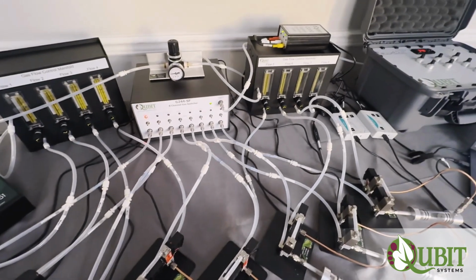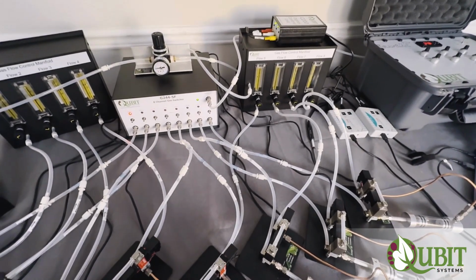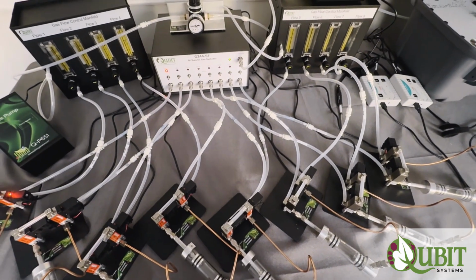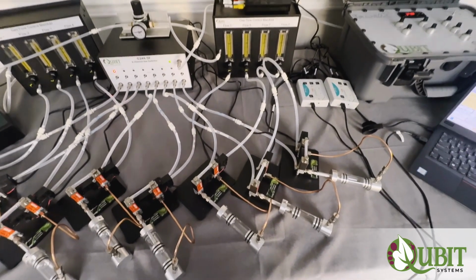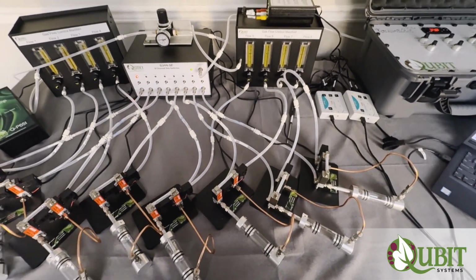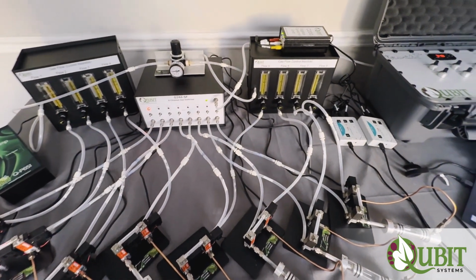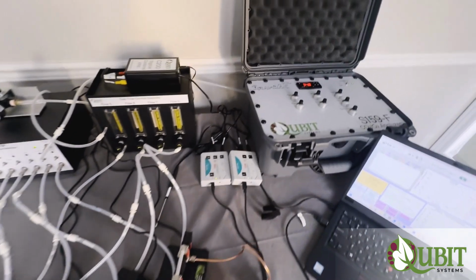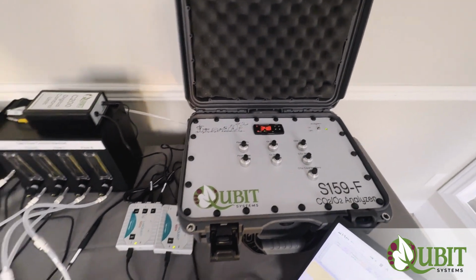So one thing that you have to keep in mind when you select stop versus open flow is the activity of the animal. Make sure that you're dealing with small inactive animals, which would otherwise produce oxygen differentials too small for the resolution of the S159 CO2 O2 analyzer.